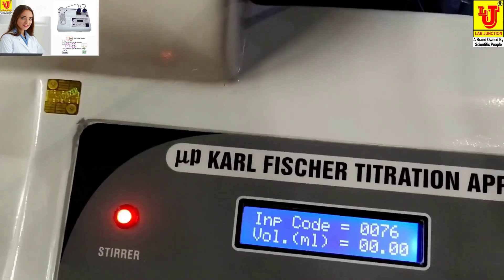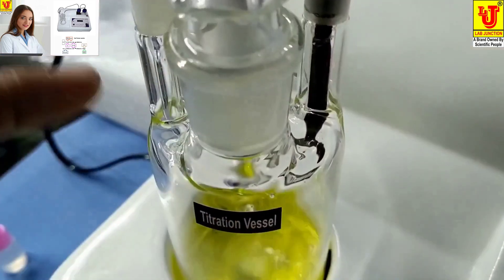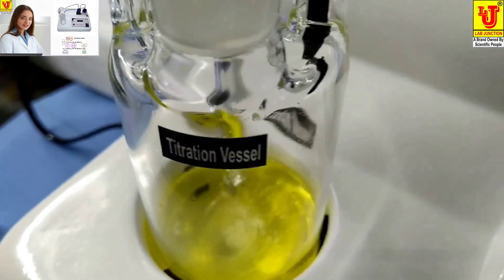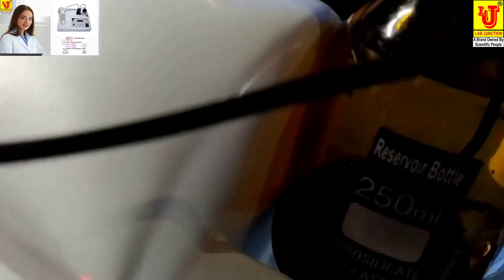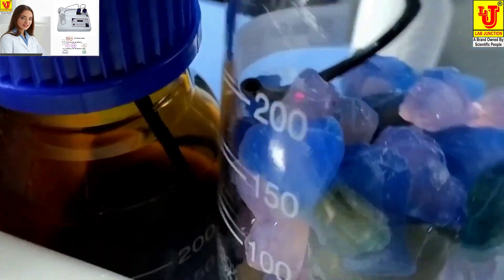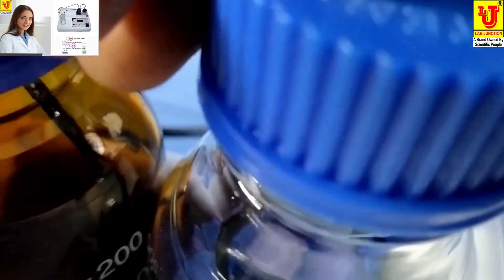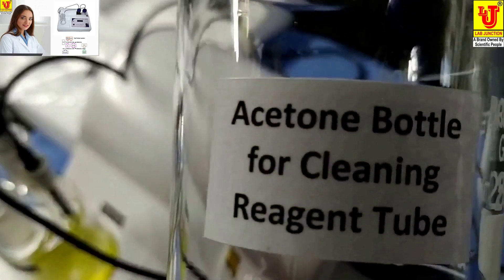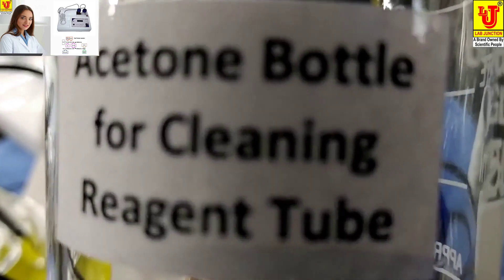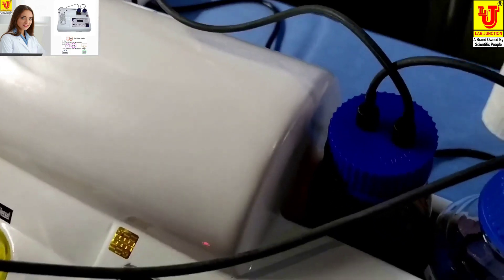The supplied accessories are: one Titration Vessel with four mouths, one Reservoir Bottle, one Silica Gel Bottle, and one Acetone Bottle for cleaning Reagent 2.